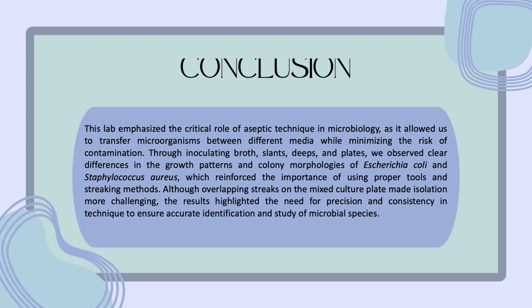Although overlapping streaks on the mixed culture plate made isolation more challenging, the results highlighted the need for precision and consistency in technique to ensure accurate identification and study of microbial species.